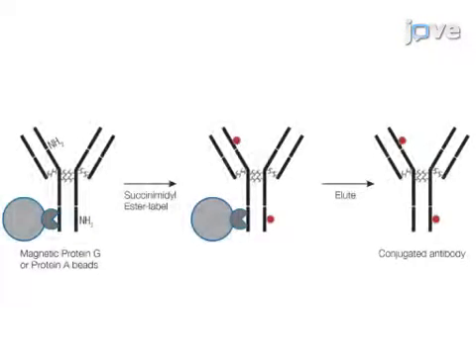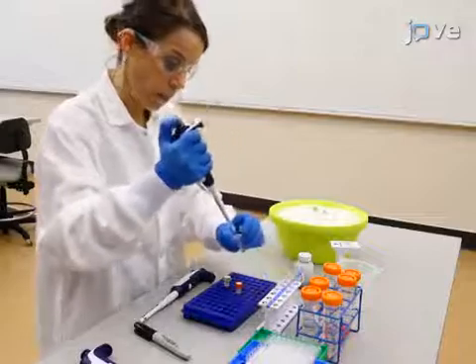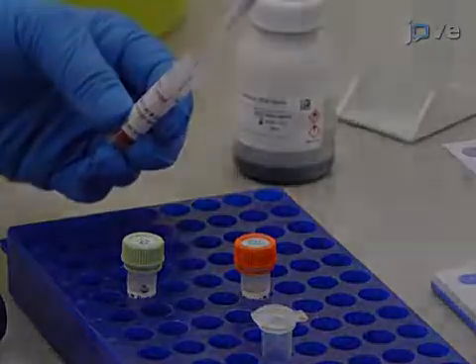To label the antibodies using amine chemistry, after the second wash, replace the wash buffer with 100 microliters of amine conjugation buffer and add 2.5 microliters of freshly prepared amine reactive dye.